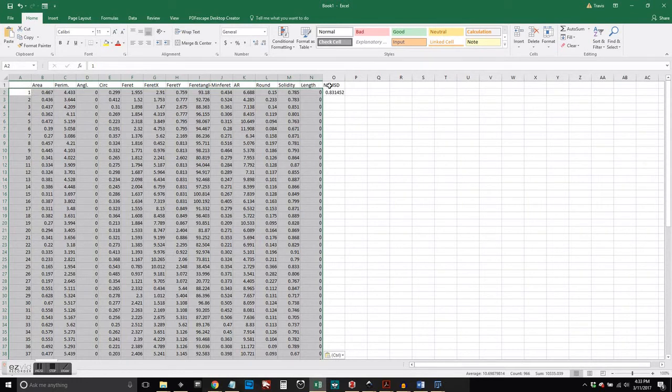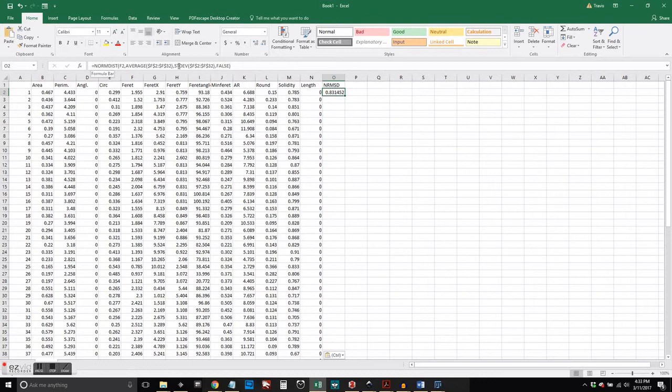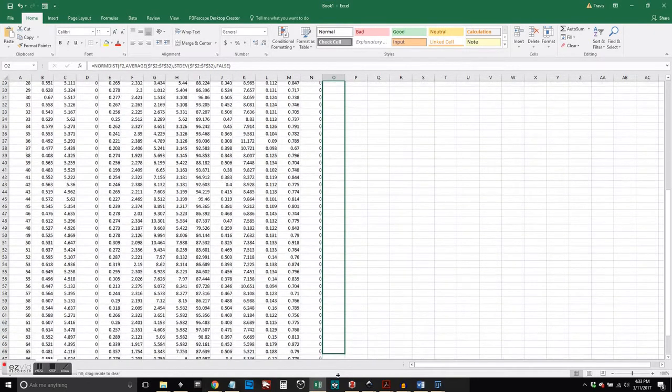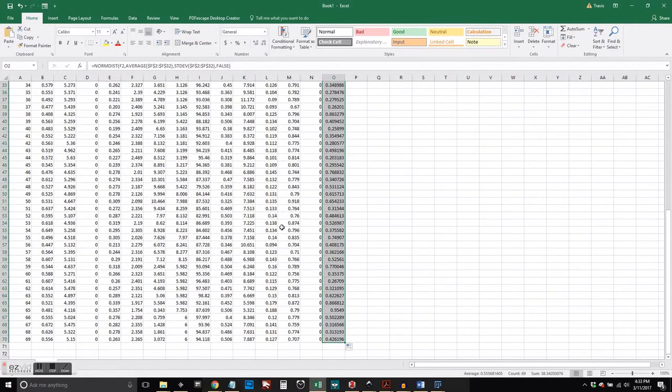Okay, so now we have our data, and we've plopped that into Excel. Again, we're going to focus on the ferret value, the maximum distance between any two pixels within an object.